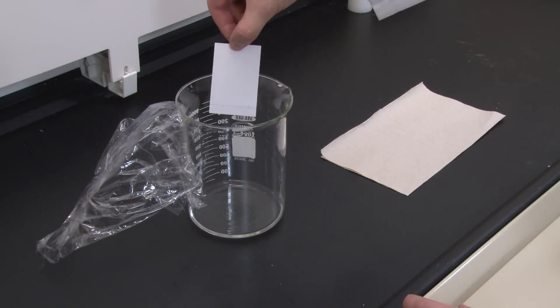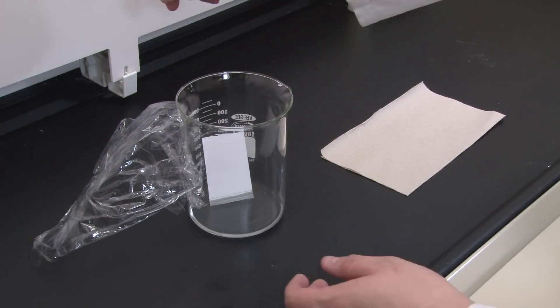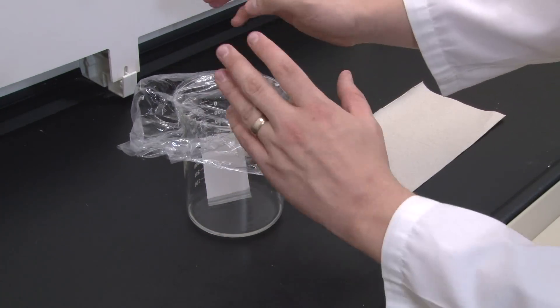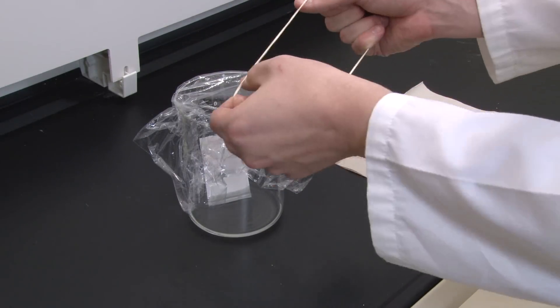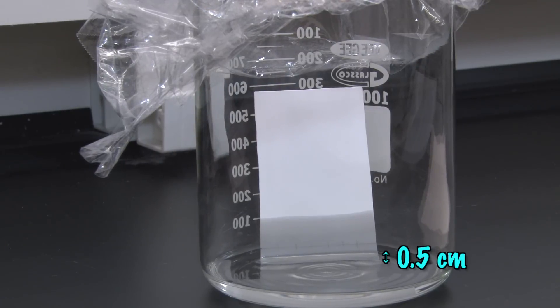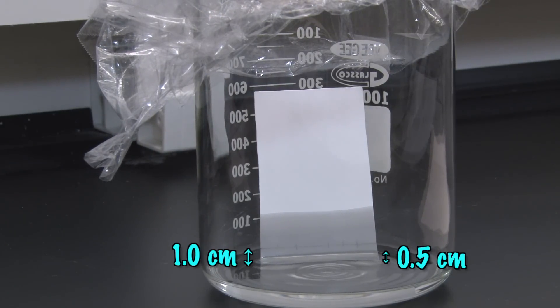Once all your spots look good, you're ready to carefully lower your TLC sheet into the developing chamber, and replace the cover. Make sure the sides of the sheet don't touch the beaker, and make sure the spots remain above the surface of the liquid. That's why we poured the developing solvent to a depth of one half a centimeter, while the spots were made one centimeter from the bottom of the TLC sheet.